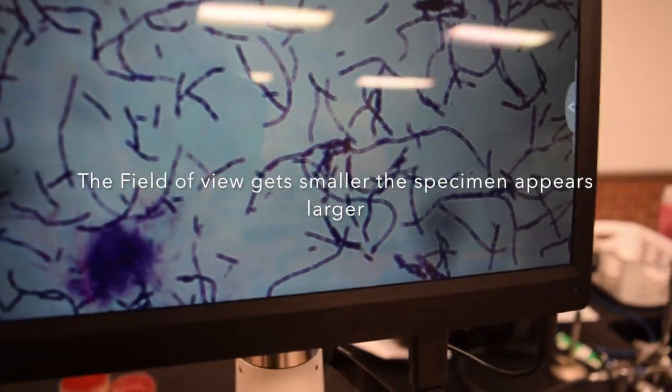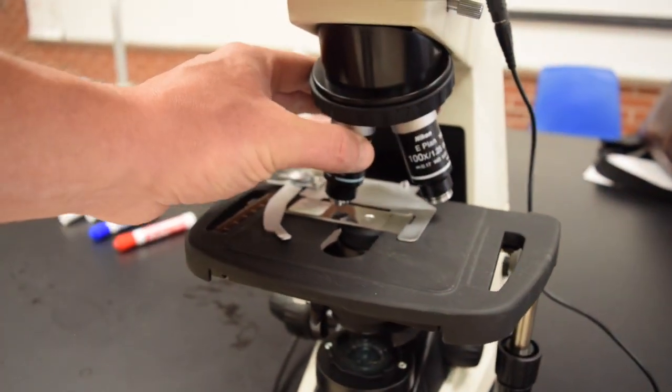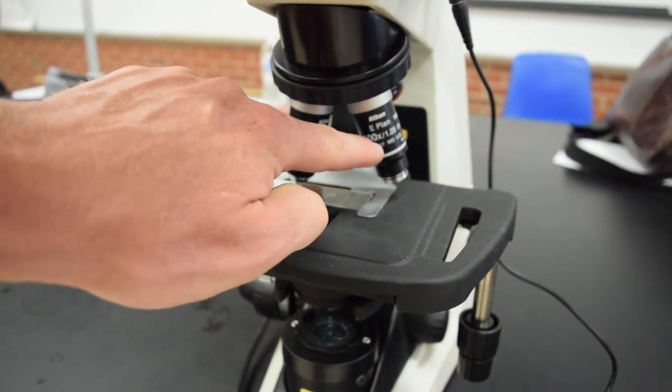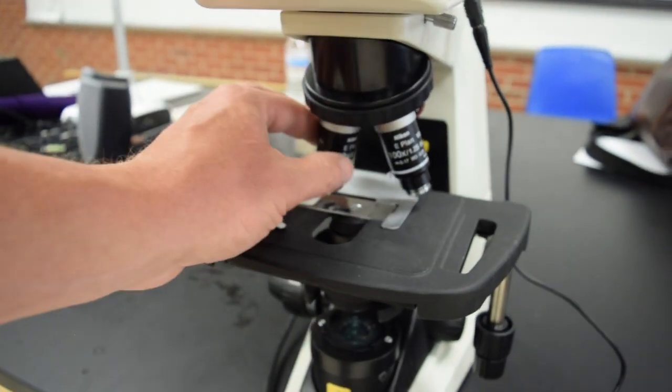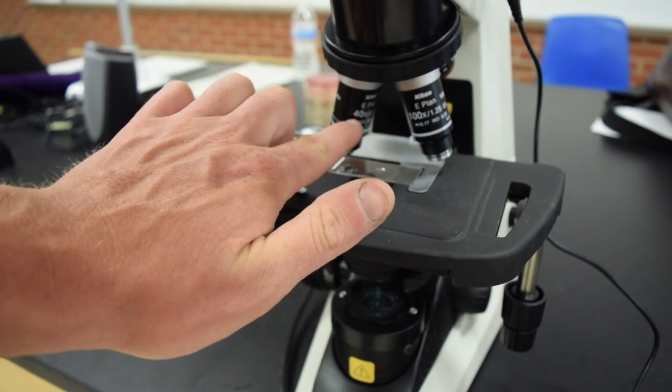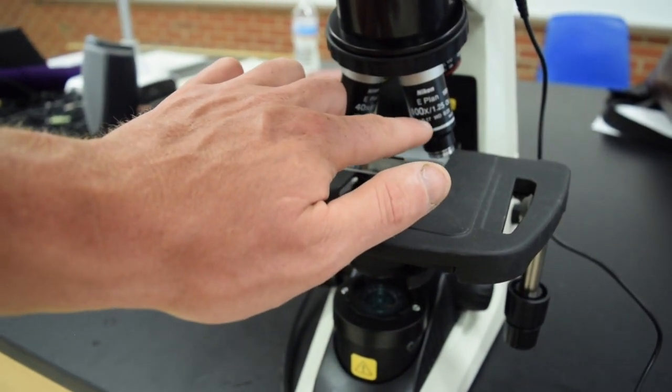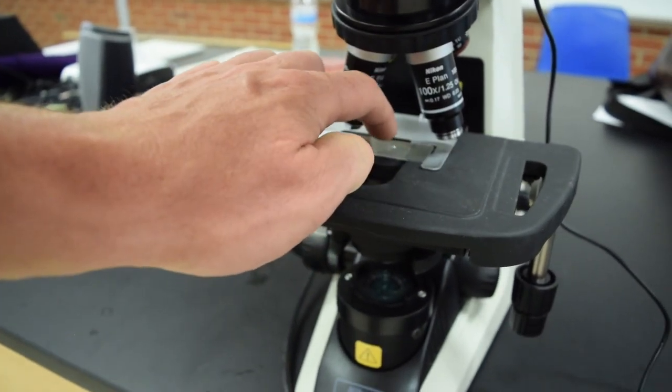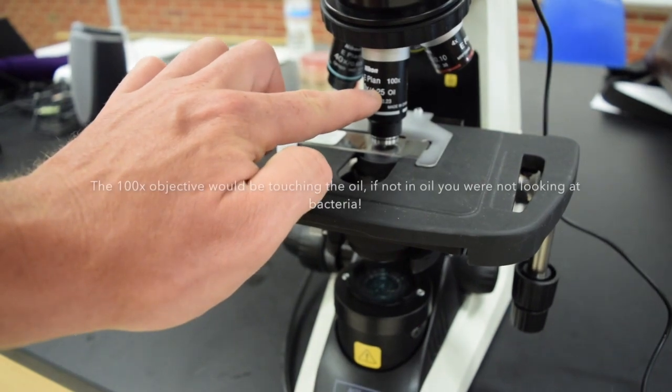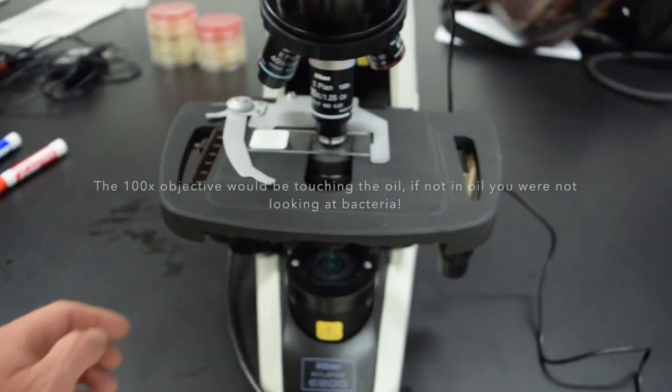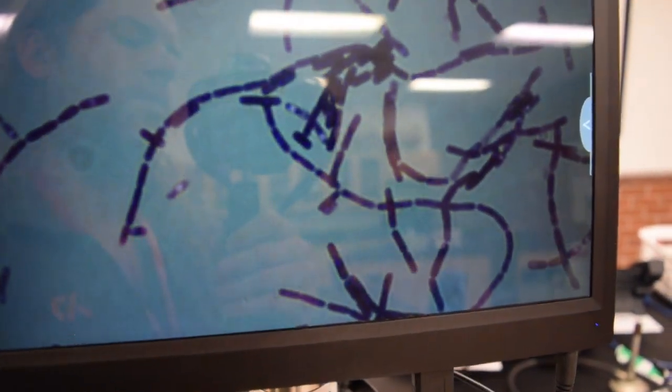I'm not going to use oil immersion, but these have that capability. This 100x objective says 'oil' right on the lens. When looking at bacteria and doing gram stains, you would move the 40x objective out of the way, add a couple drops of oil right to the slide, and then move that oil lens into the oil so the lens is actually touching the oil. From there, you would use the fine focus to view the bacteria.